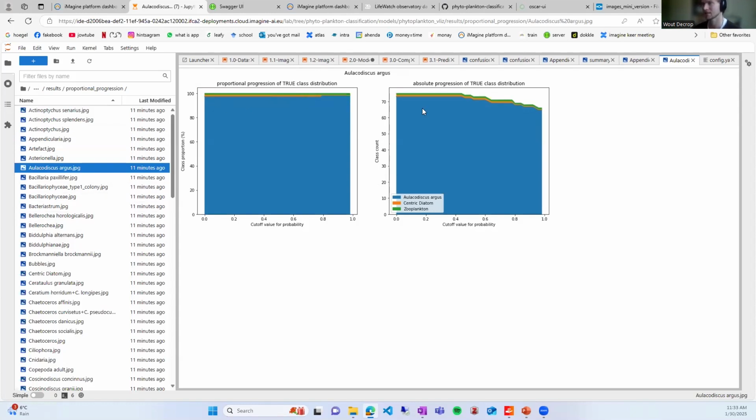And then this is done for apicundularia, but if you look at this class, for example, here, it kind of stays the same the whole time. So you can increase the cutoff ratio, but you don't really get extra performance. It remains the same proportionally. You get a very small peak over here, but you can, for example, say to the user, hey, if you're fine with 98% performance, then for this class, if the model predicts it, you don't even have to validate anymore. You can just say, hey, it's correct, and we can validate the others. This seems good enough, so it depends on your call.